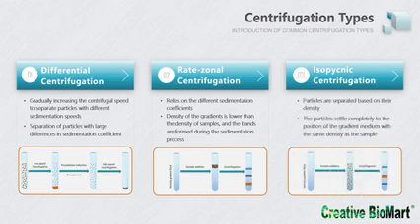Isopycnic centrifugation separates particles by using differences in their density. This method often uses cesium chloride as gradient. For self-formed gradient, the sample is mixed with the gradients, and then under the action of centrifugal force, the particles with low density float up and high density settle down, until all the particles move to the position of the gradient with the same density. The particles form several bands in different positions according to the difference in density. Isopycnic centrifugation has nothing to do with the shape or size of the sample particles, but is closely related to the density of the samples.